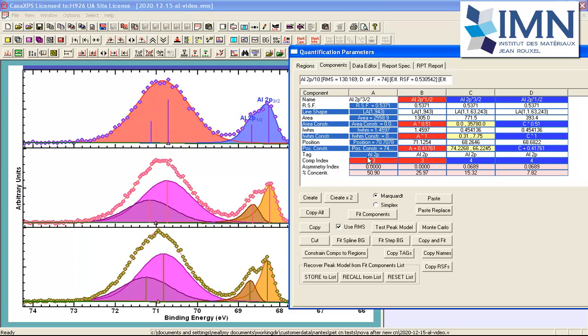And the idea is that you can build relationships between peaks in terms of colours. That's one form for the display, but it's also useful if you want to update, for example, the line shape. So if I were to set this value to be 843 instead of 943, and then use a character hash, when I press return with this hash character in place, it will then update components with the same component index.